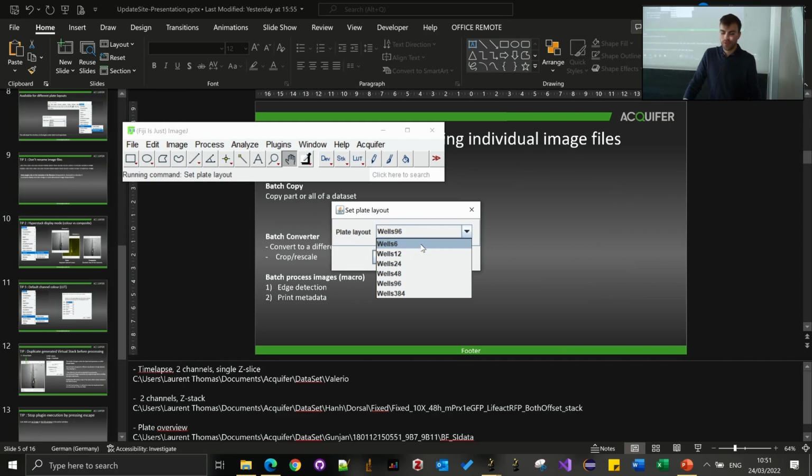Something like that. So I guess the best in this case is again to use this combined hyperstack, because this plate montage is really for fixed layouts. I think it would be a lot of work on my side to adjust it for a custom layout. But maybe I can just take some of your data, if that's fine, to have a use case of a custom layout, and I can try to find an intuitive solution.